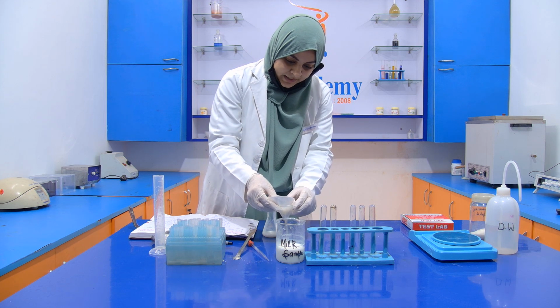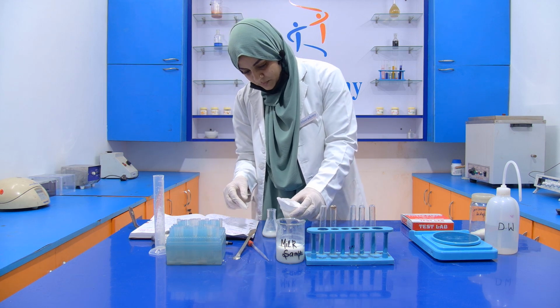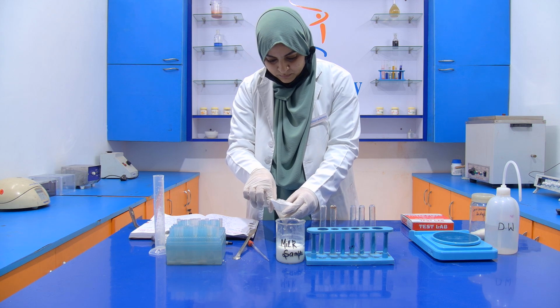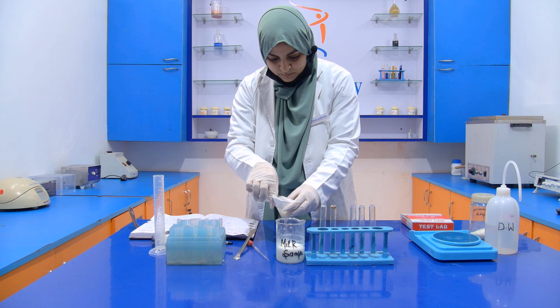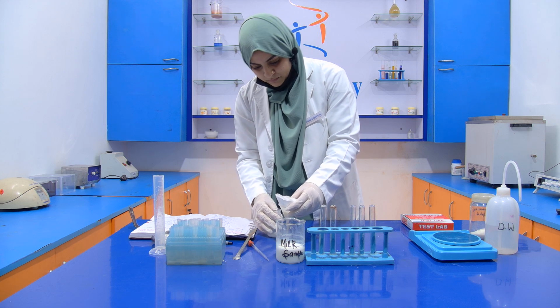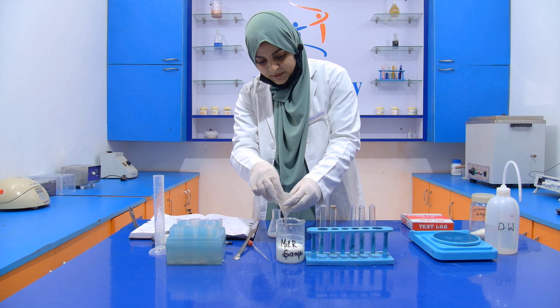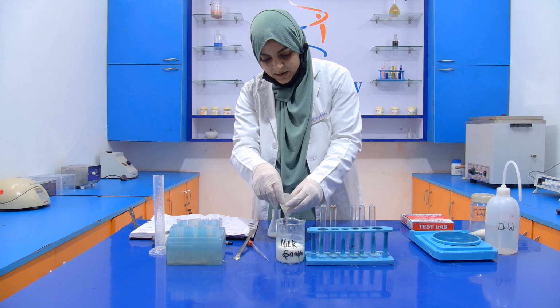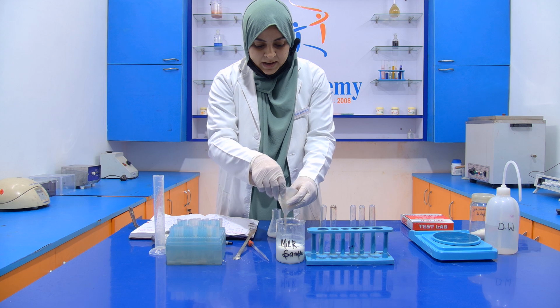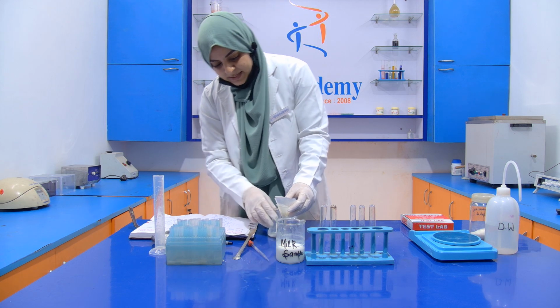See, it takes time when we are filtering it. When it is filtered properly, we have to take 5 ml in a test tube and keep it in a water bath at 100 degrees Celsius.